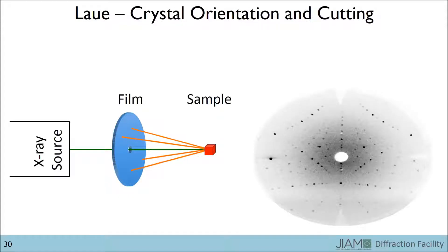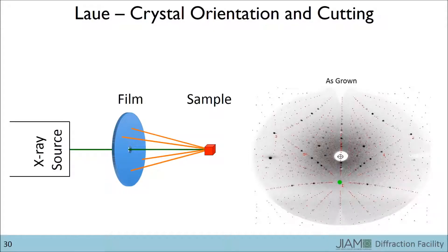Each one of these dots corresponds to a diffraction peak for a particular atomic plane. Utilizing software in the lab, we can determine which planes the dots belong to. The dot that I made green belongs to the 1-0-0 plane, which is the plane on which I wanted to test.